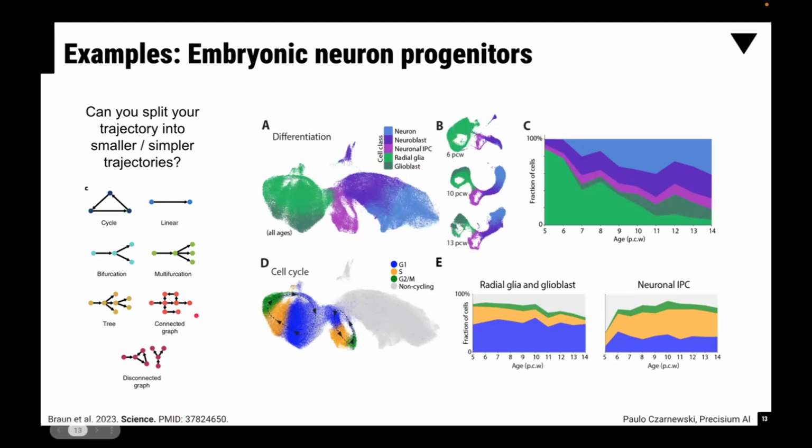So for example, for our lecture and the exercises, PAGA can actually take care of this one, not much on the disconnected, a little bit, but it's really hard to use actually. And Slingshot, which is the other one, can reach up to this one. So these are in levels of complexity, but trees and connected graphs are the ones that you will usually see quite often.